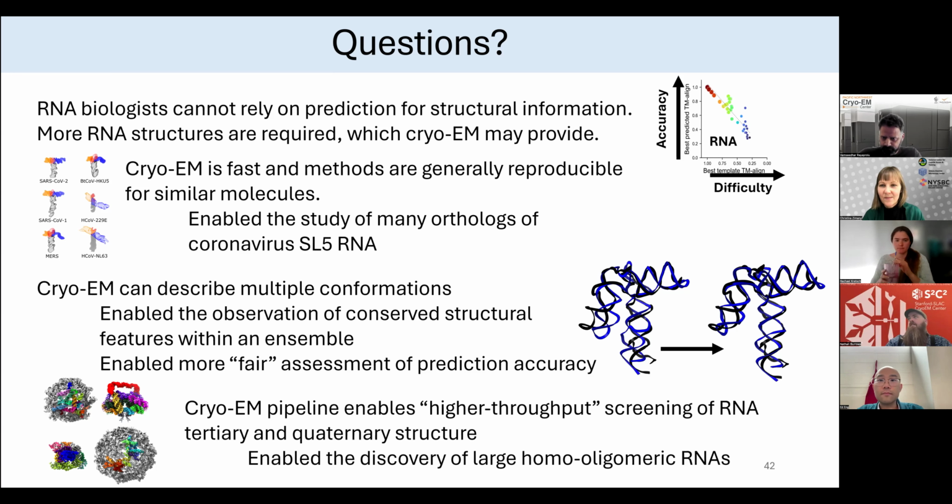Cool. And then our last question for you here is that RNA is forming aggregation towards the periphery of grid holes. Could you suggest any tricks to avoid that, and any reasons for aggregation, things that might be causing it?